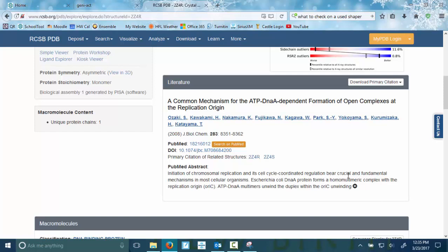So at this point, at the end of Module 3, compared to this structure-based sequence, or similarity module, and the sequence-based similarity module, module 2 that we did, you might be able already with your Clostridium gene to guess the name and function of your protein based on evidence. If you can't, especially if your protein is hypothetical and nobody's really quite sure on any of the things and you're really doing the first legwork with it ever, the other modules might help. But you should be getting pretty close.